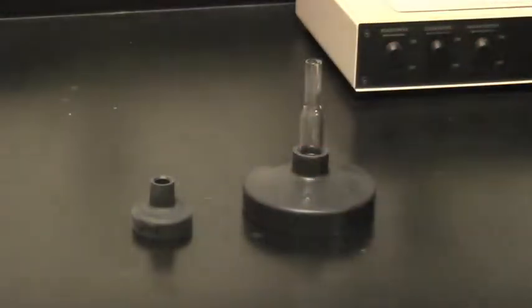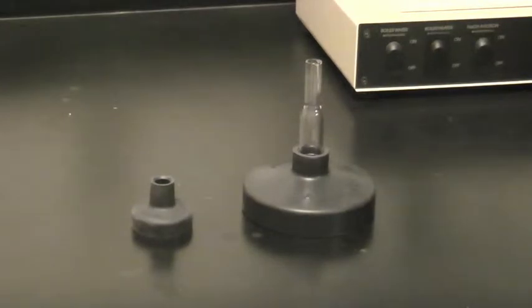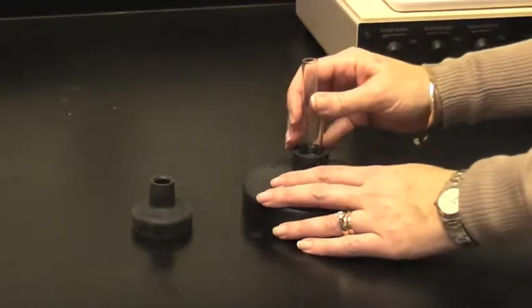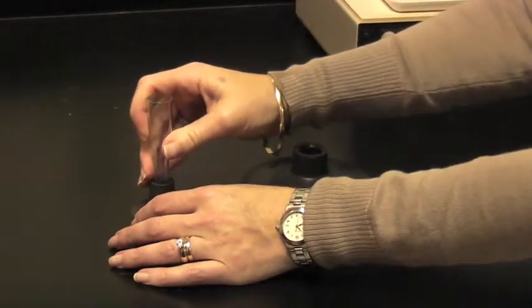LabConco offers half inch to three quarter inch tapered flask adapters that are reversible to accommodate both half inch and three-quarter inch flask tops and valve ports.